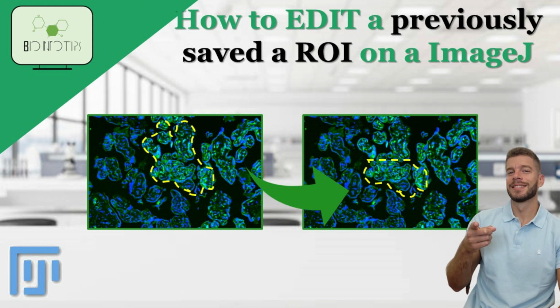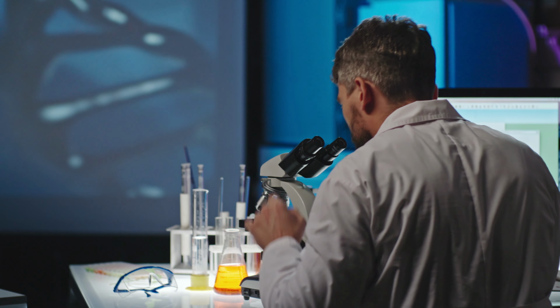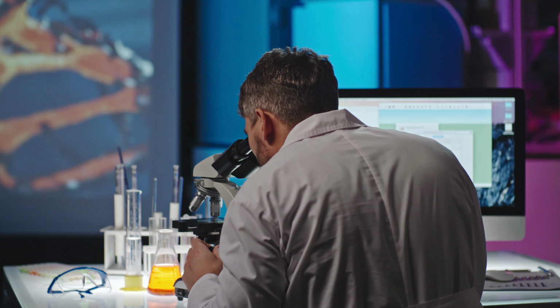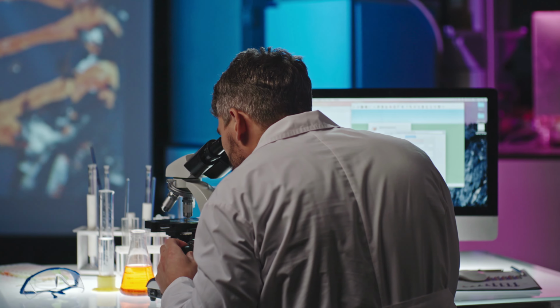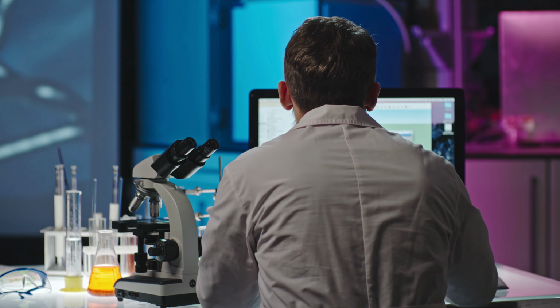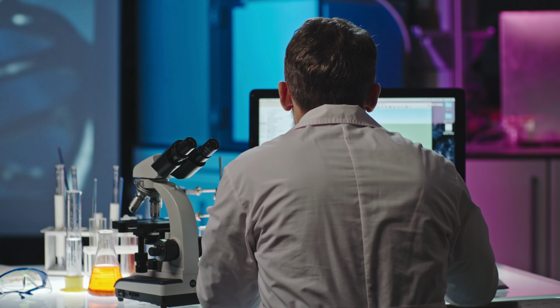Do you want to know how to edit a previously saved ROI on ImageJ? You came to the right place. Welcome to our image tutorial. Today, we're going to learn how to edit the shape of a region of interest, or ROI, in ImageJ. This can be very useful when you need to refine your selection for accurate analysis.